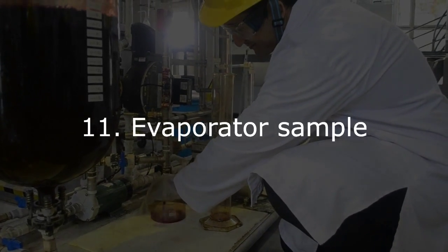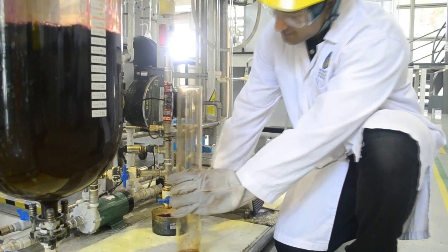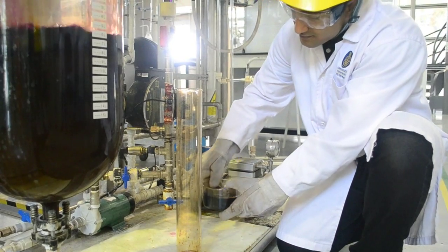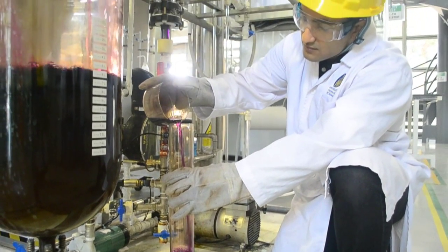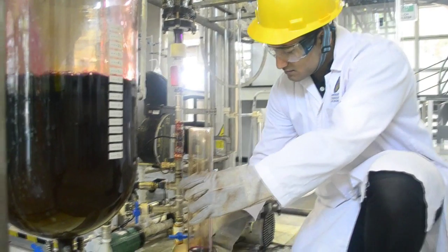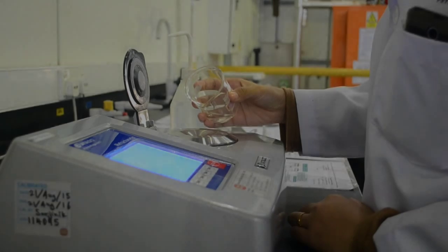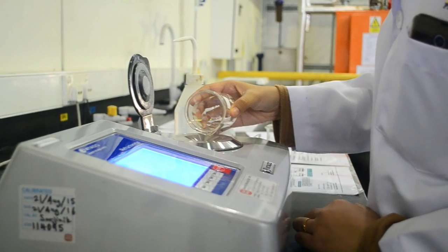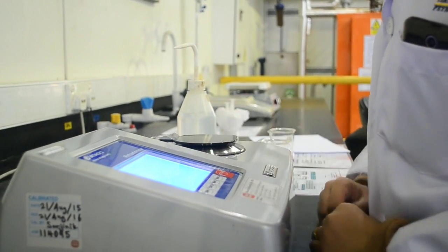The third sample is the evaporator sample. And finally, measure the volume and record the refractive index of all samples. Return all the samples to the feed tank.